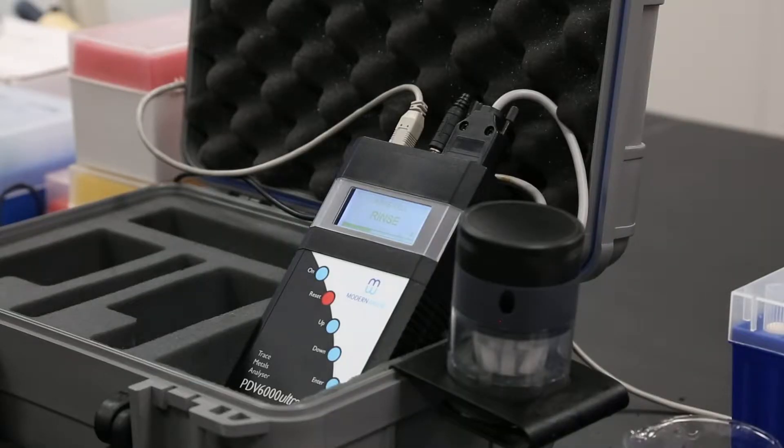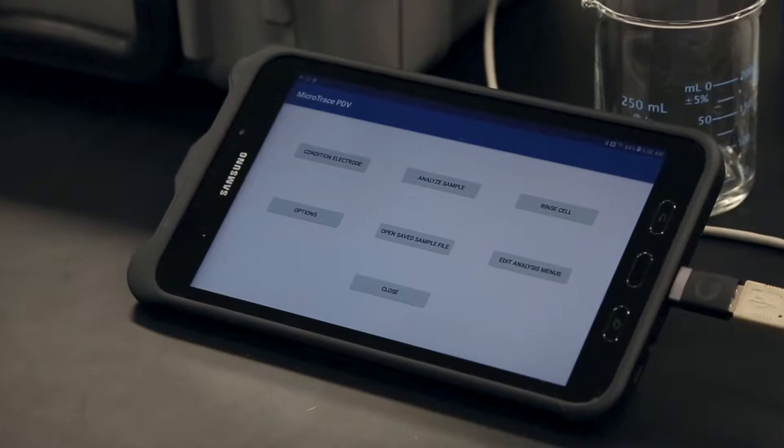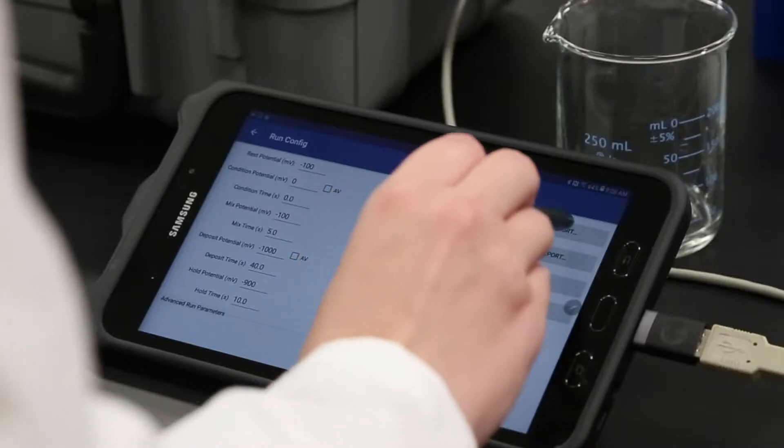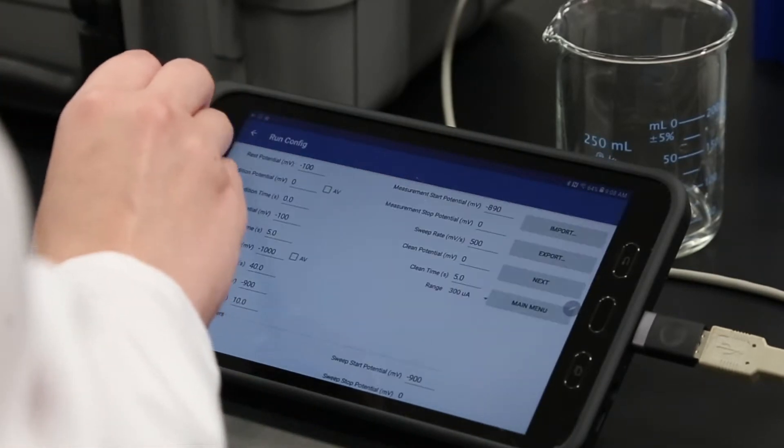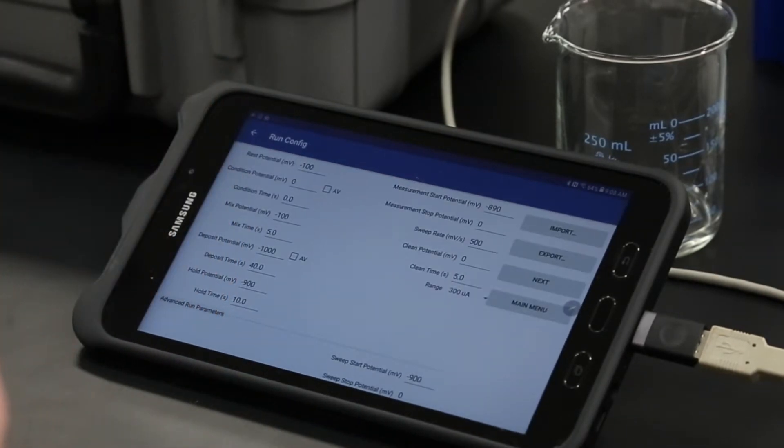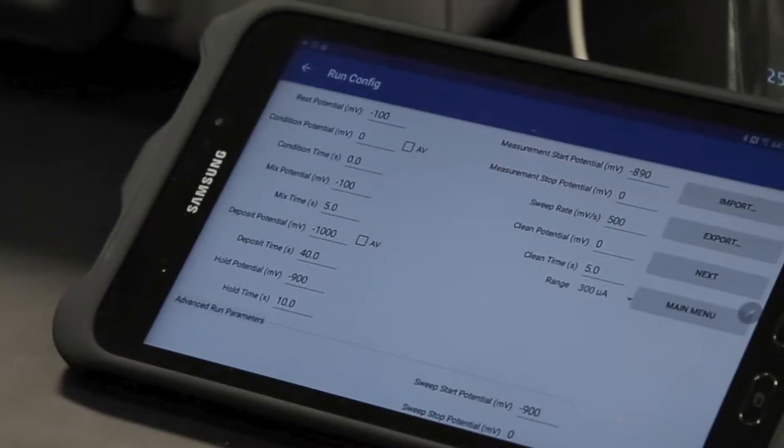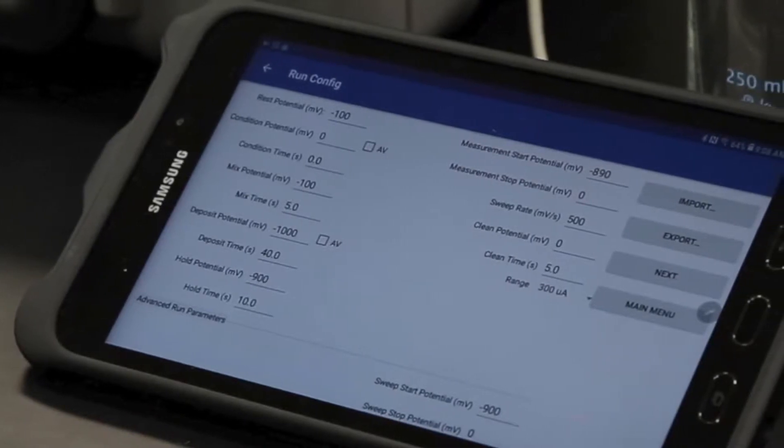Test the connection to the PDV by clicking the rinse cell button. If the connection fails, remove and reconnect the OTG adapter and re-acknowledge the pop-up. If there is still no connection, check the USB connection and restart the app. From the main page, choose Edit Analysis Menus to open the Run Config page and import or load the desired analysis menu. Menu parameters are the same as used in VAS and given in the application notes.